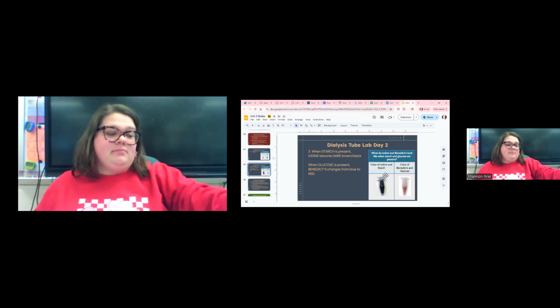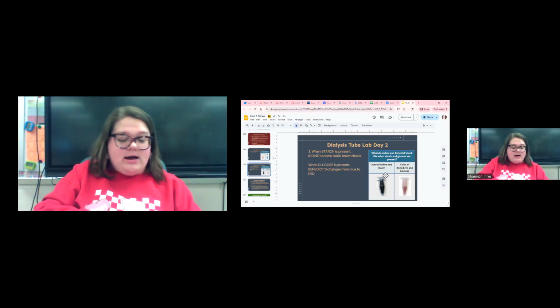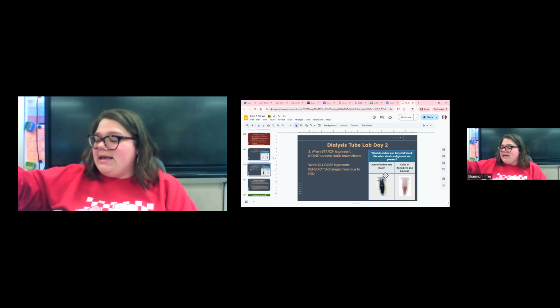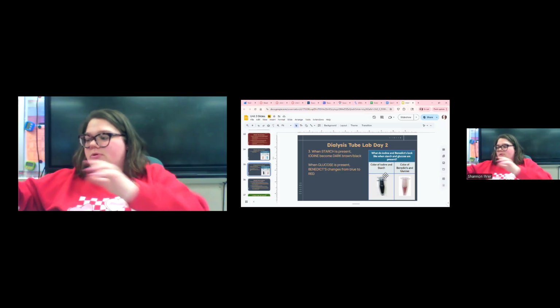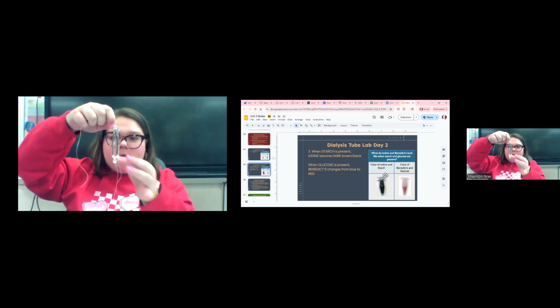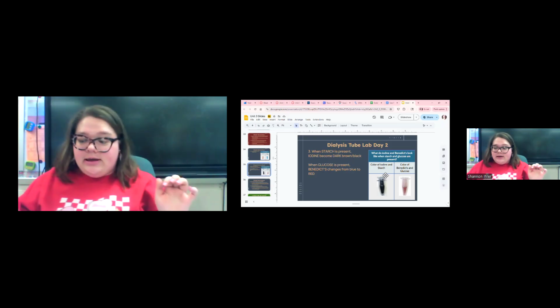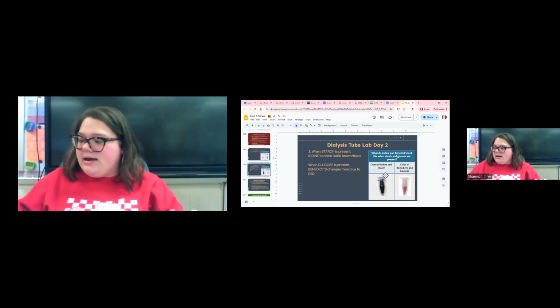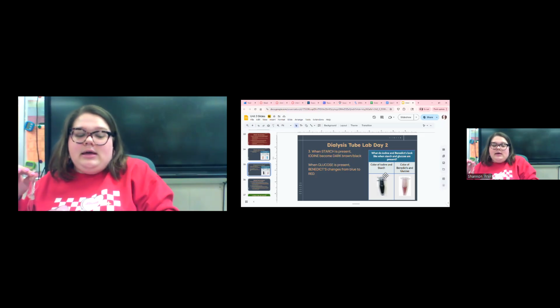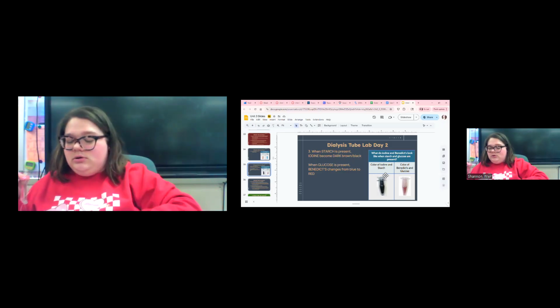In the meantime, what we can do is we can look at part 5 while we wait for that to sit, and we're going to look at what is inside of the tube. So notice the tube still has a lot of liquid in it. And I'm going to carefully cut it open and take the liquid that is inside the tube and also put it into these tubes.